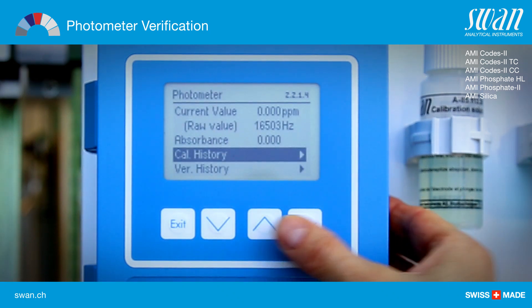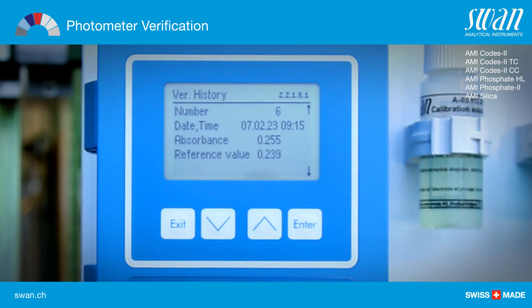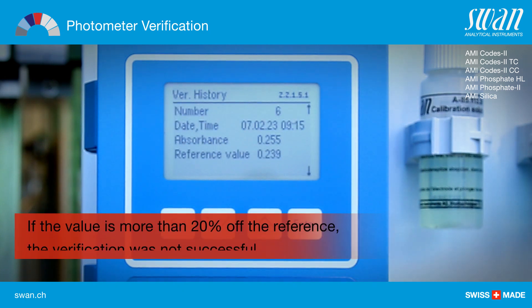The verification is successful if the difference lies within the limits.